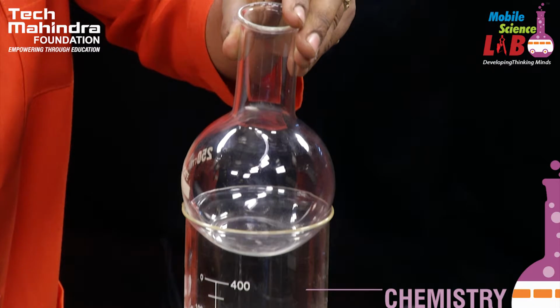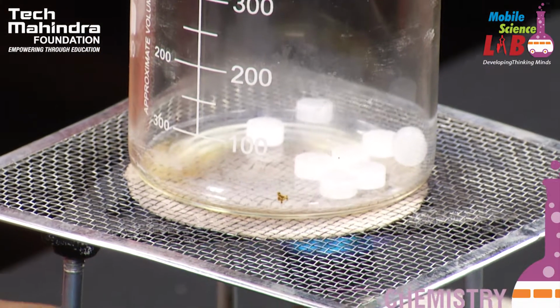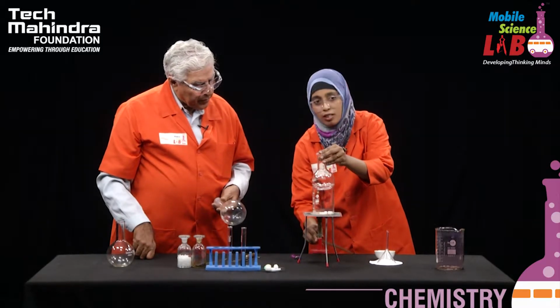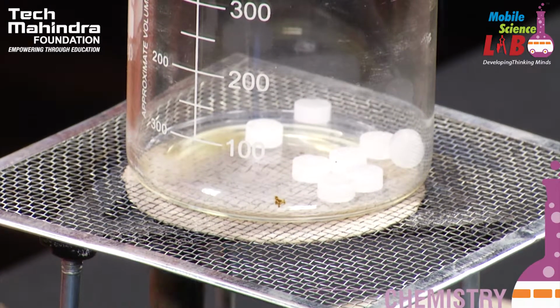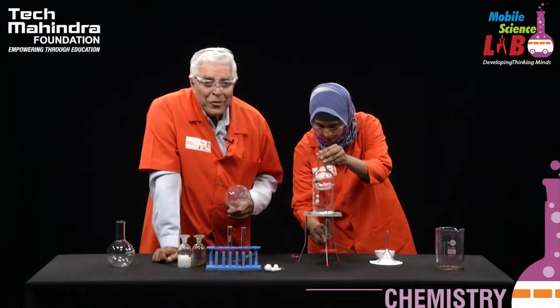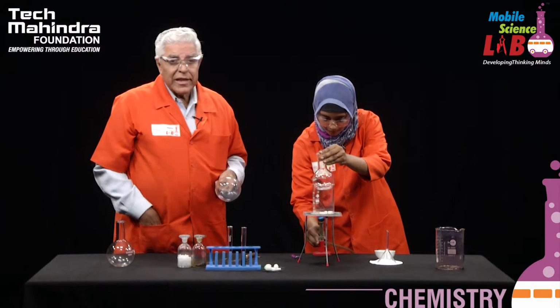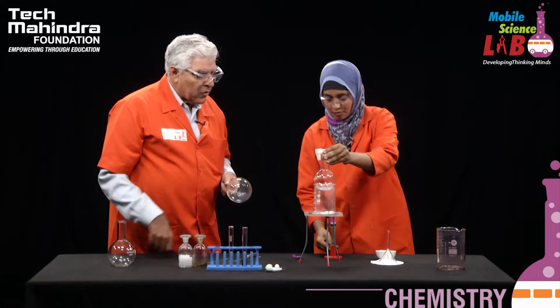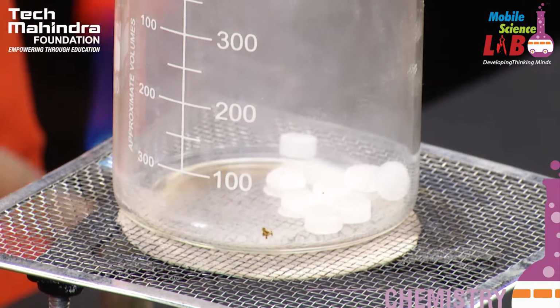The way we have heated the iodine, similarly we are going to gently heat this beaker. The concept of doing this experiment again with the camphor is that iodine is quite costly and rarely available in the market. Camphor is easily available in the market, whereas iodine is not easily available. It is quite costly, and also we should be careful because it can be dangerous. Yes. So we can see vapors coming up. Just hold it like this for a little while and then let us see what happens.